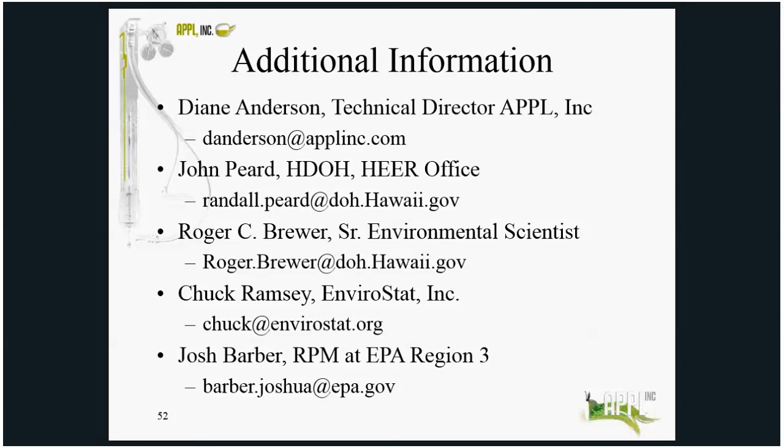I guess in Hawaii at this moment, we generally want to see both, if you're going to first test the less than 2 millimeter fraction and then grind it. And we've done a lot of that. That's maybe just for initial screening of the site.